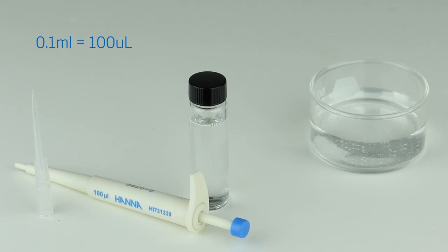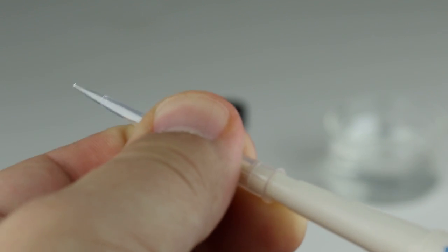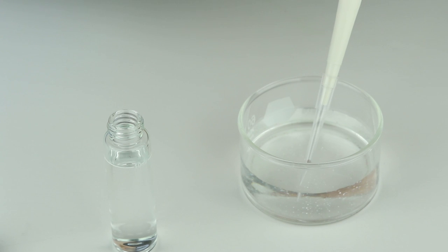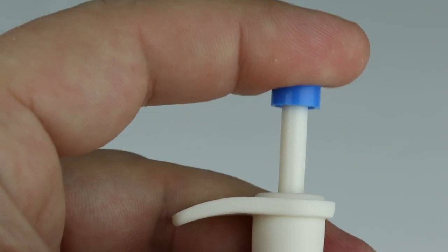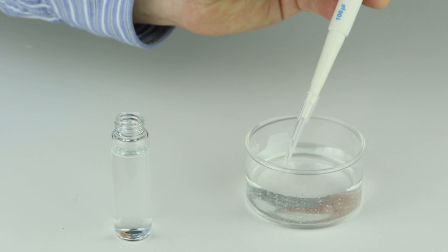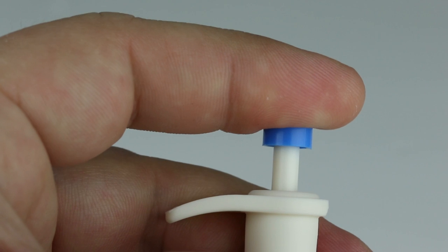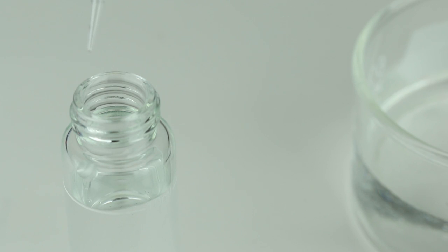To use the Hanna Instruments micro pipette, first attach the pipette tip. Push the button to the first stop and then immerse the tip into the sample. Slowly release the button to its original position. Then wait two seconds to catch any drops before dispensing the sample into the cuvette. For best results, dispense liquid until you reach the first stop. Once the liquid is dispensed, push the button to the second stop to remove any remaining liquid.